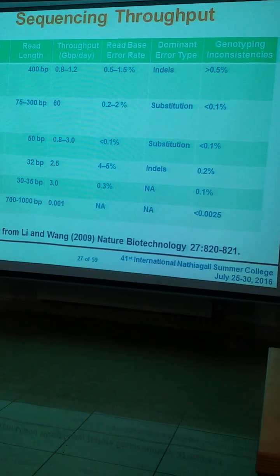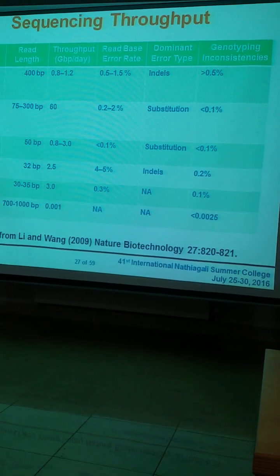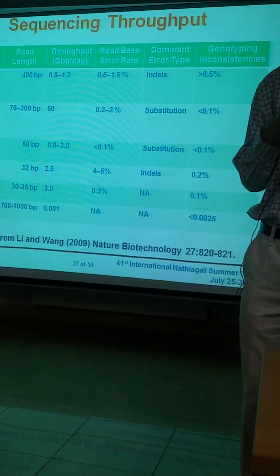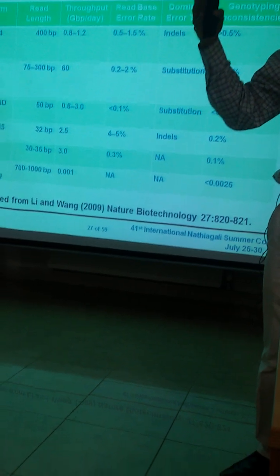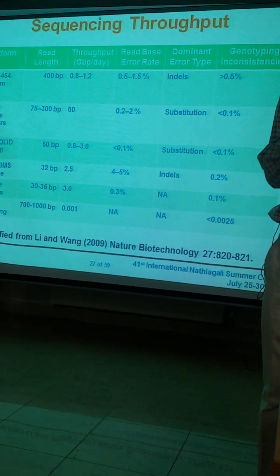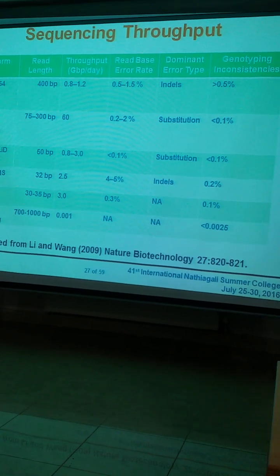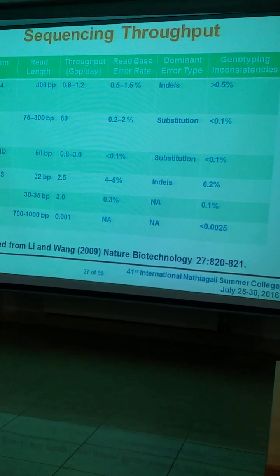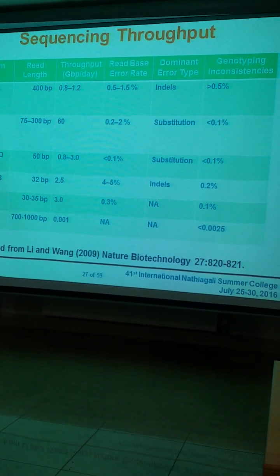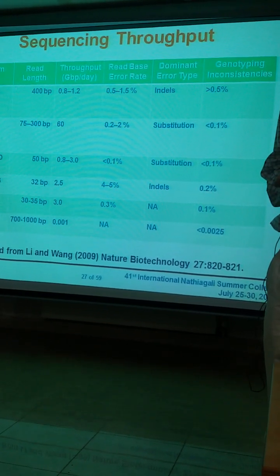Do they use some specific algorithm for comparison or alignment? No, you use whatever your preference is. There are now a couple of standards for calling the mapping files and also for variant calling, which people usually use and are considered to be reliable. But I think every time you use it for the first time, always compare it with something which has been published and see how your results compare with that. Because if they're really bad and there's low concordance... I just want to ask, when they compare, do they use some specific algorithm for comparison?